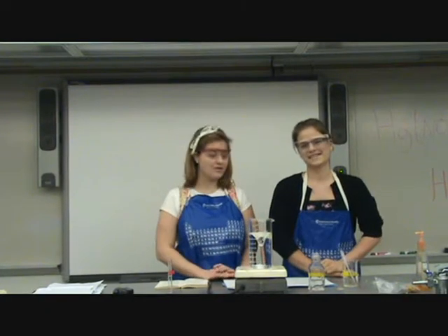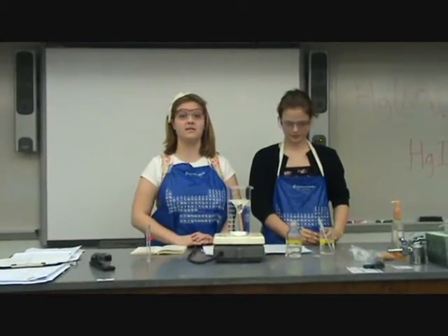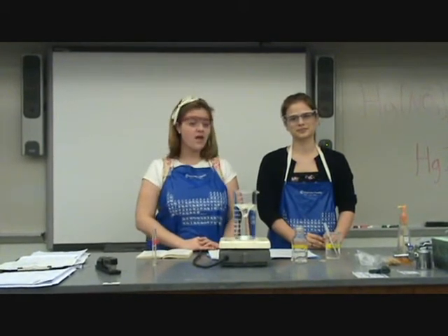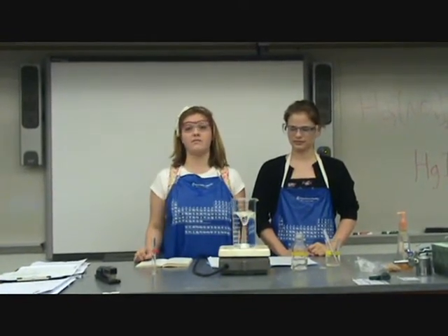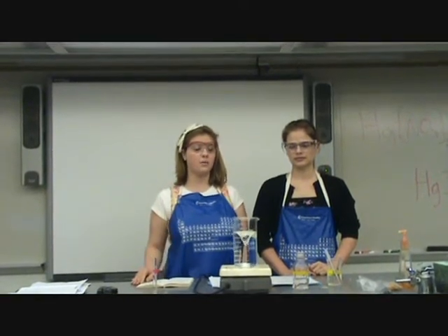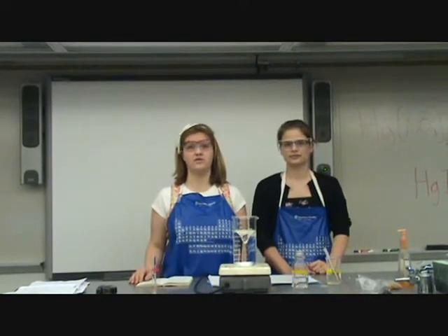Hi, this is the orange tornado experiment, and it will demonstrate the concepts of equilibrium and solubility with an emphasis on Le Chatelier's principle. And as you notice, the experiment is pretty small and contained, and originally the write-up for the lab would have produced much more mercuric waste, but we reduced it so that it only produces about 800 milliliters as opposed to 4 liters.